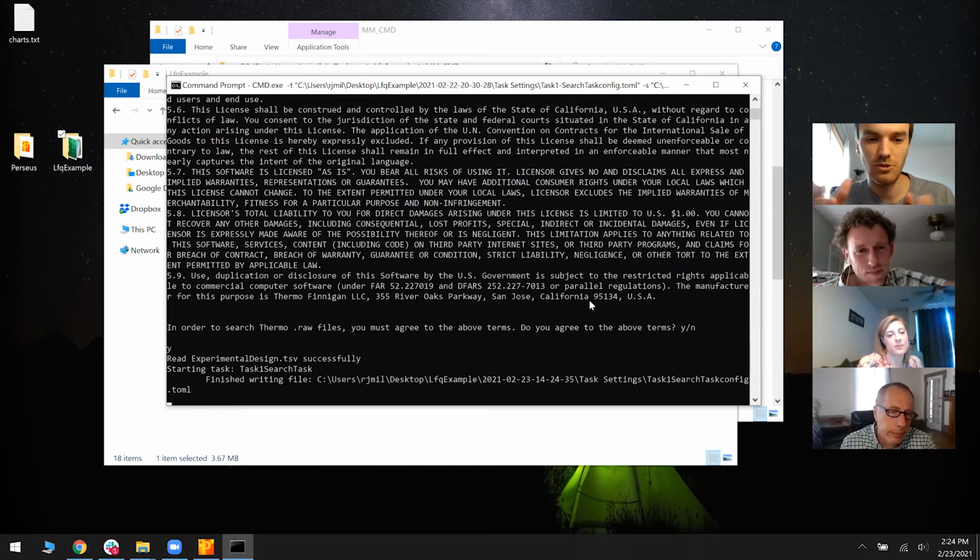And then it's doing the search. And I'm on a laptop, so it's a little bit slow. I might cancel it partway through to show you the other stuff.